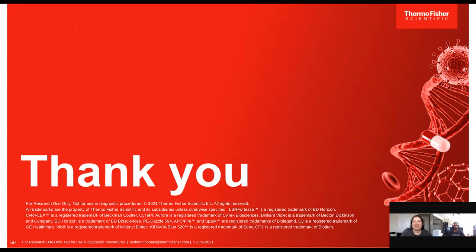I'm just thinking about what things might be relevant. One important thing is being able to use your sample fully with spectral, but also making sure that the panel is really well designed, and that you're not picking up something that may be an artifact, say from spread into the channel. So you are able to use more of your sample, but you may have to take more time designing these bigger panels. Once you do that, it should be good to use.